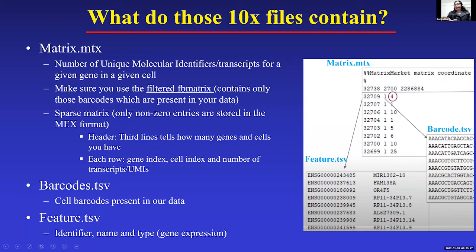And from the next line onwards, you get for each gene whether it belongs to cell number 1, cell number 2, and so on and so forth. First, all the genes that were in cell 1 are on the top, and once cell 1 is covered, you will see cell 2 with the number 2 and the list of genes that were present.